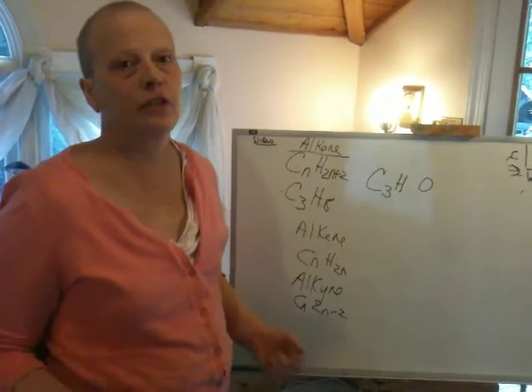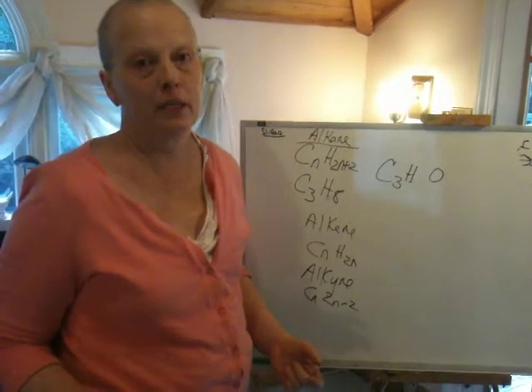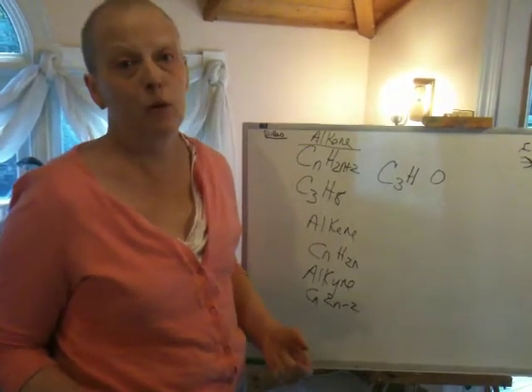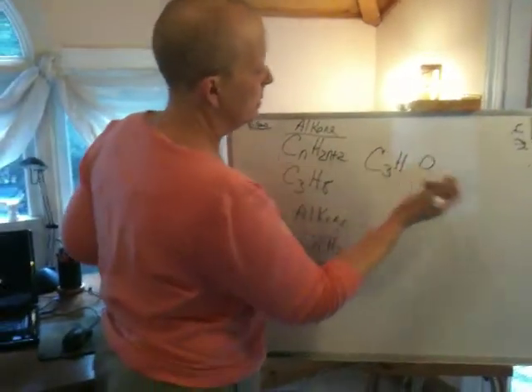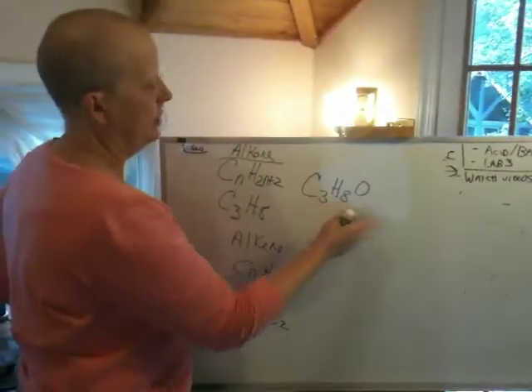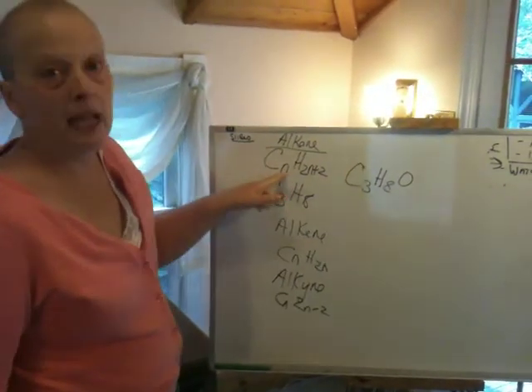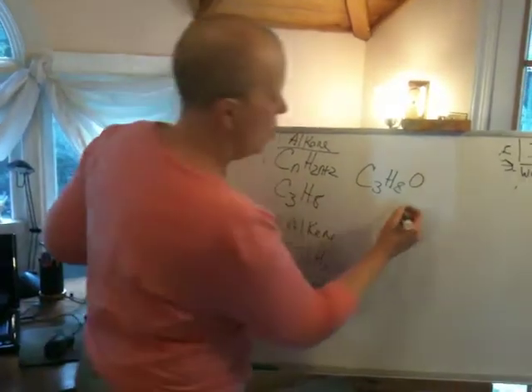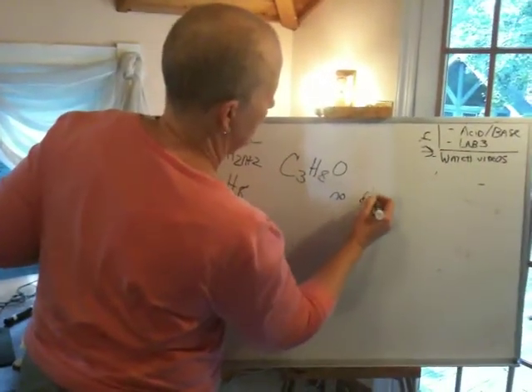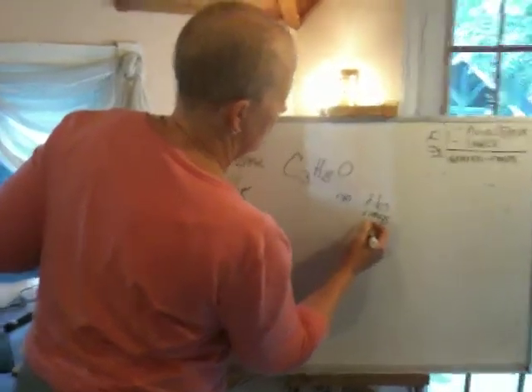If a molecule is deficient in hydrogen, it very definitely has certain structural elements in it, and you have to incorporate them. And you'll see that in the formulas that I'm going to show you. So this molecule is C3H8O. So there's info in the formula. This formula matches the alkane formula for something that has 3 carbons, which means it has no double bonds, no rings, no triple bonds.